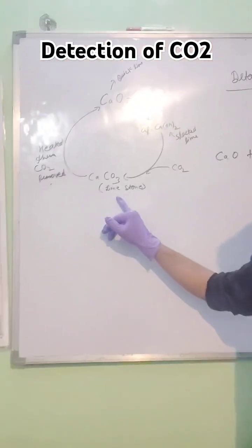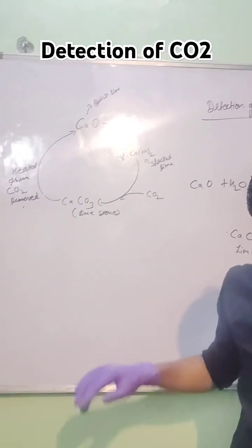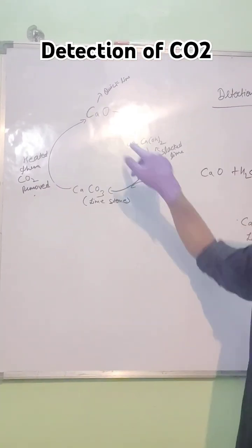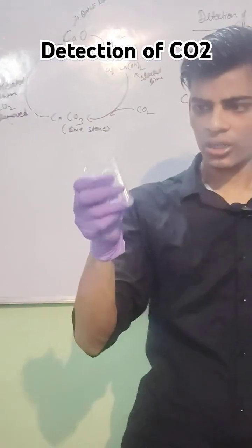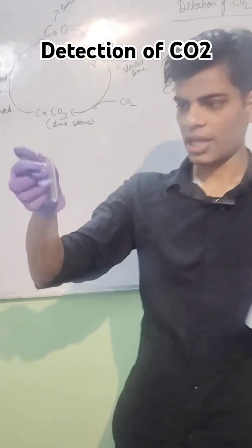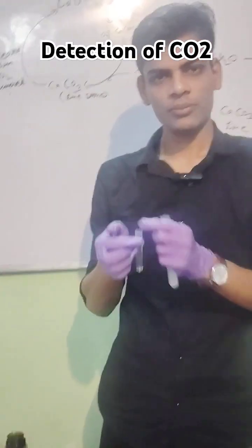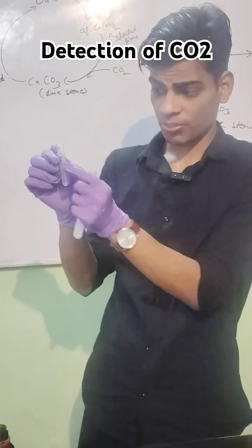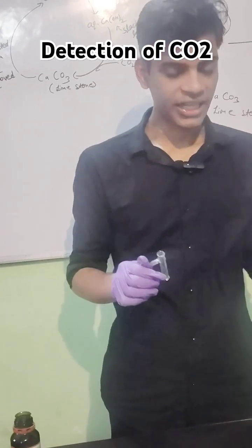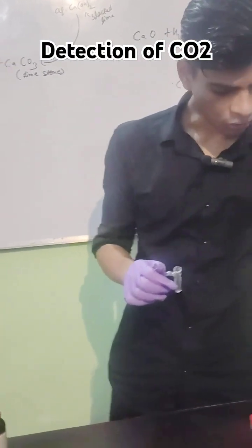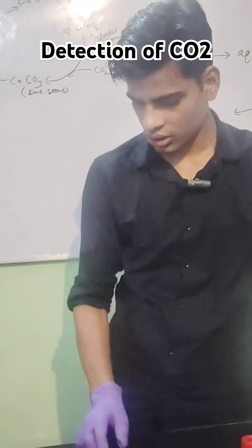So basically here we have a reaction. You can observe what is happening in this case. We can also perform in a test tube. What we have to do is take the same reagents and the formation of precipitate happens in the same way. When we perform in the test tube, that is the same process.